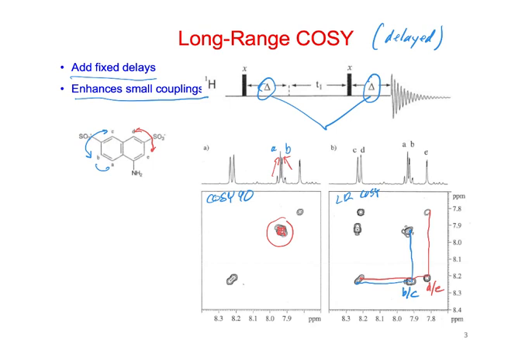So if you could make them anti-parallel and then you give it a 90, then they go into the Z direction where the small couplings aren't processing as much, and so when you tip them, they're still in the XY plane or something like that. That would make more sense. Yeah, I can see that. So maybe it is true.